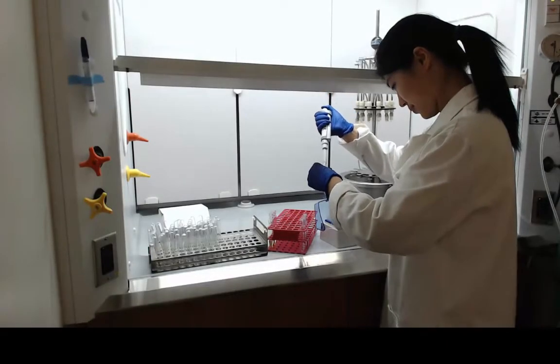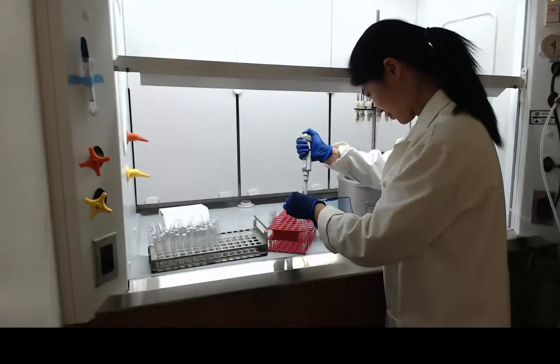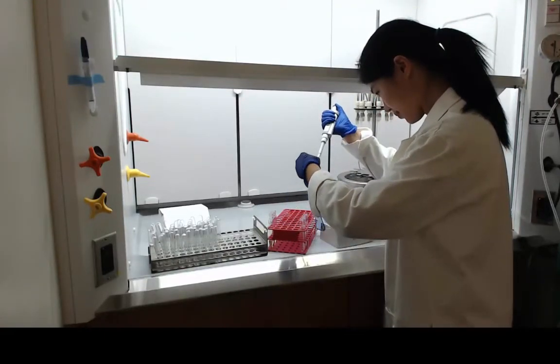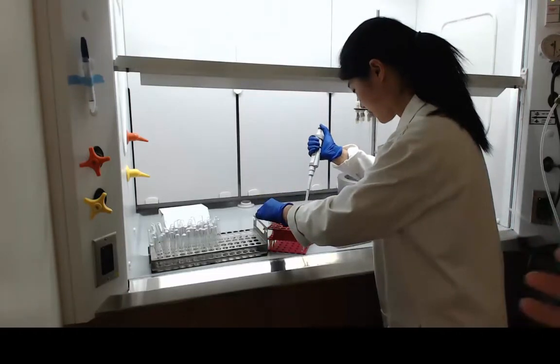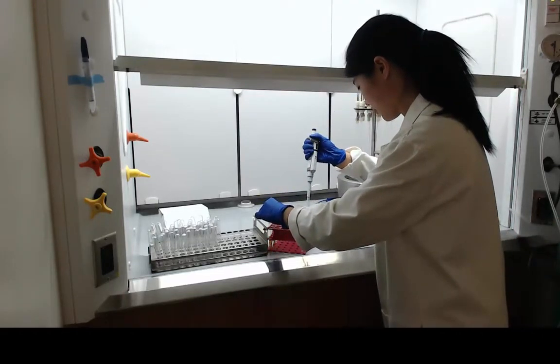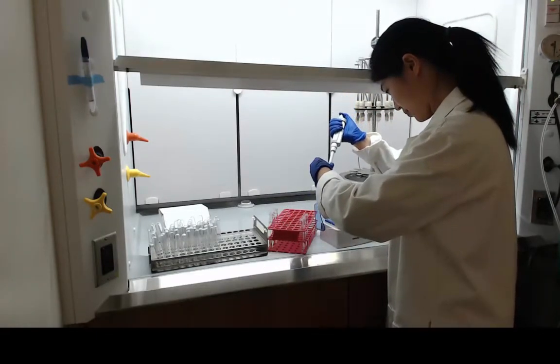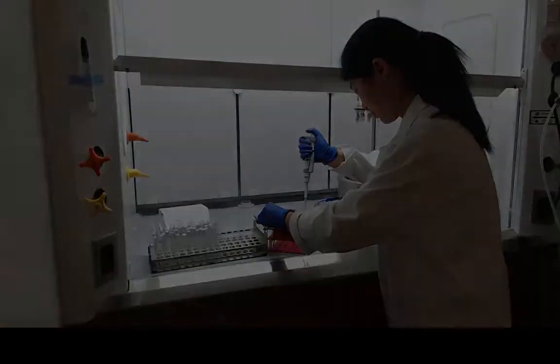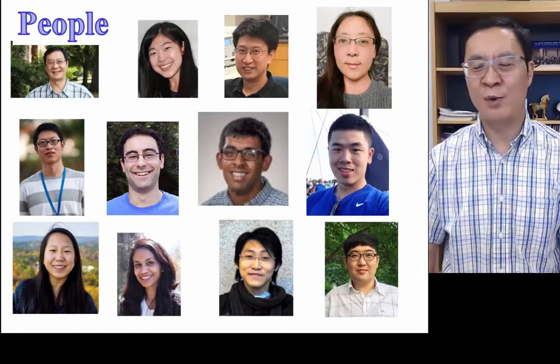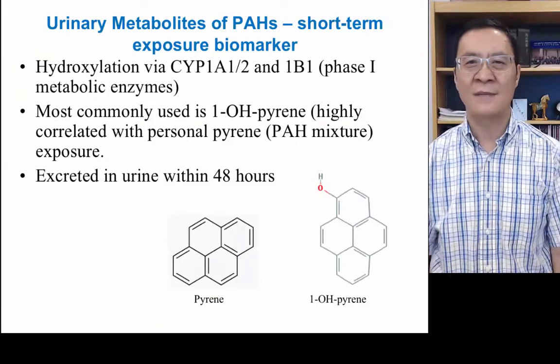Before the machine takes the sample for analysis, I showed you that for HPLC mass spectrometry, the samples will need to be prepared in a way like this. They will be processed with extraction in multiple steps to get them ready for the machine to analyze. So those are the people who have worked in my laboratory recently.